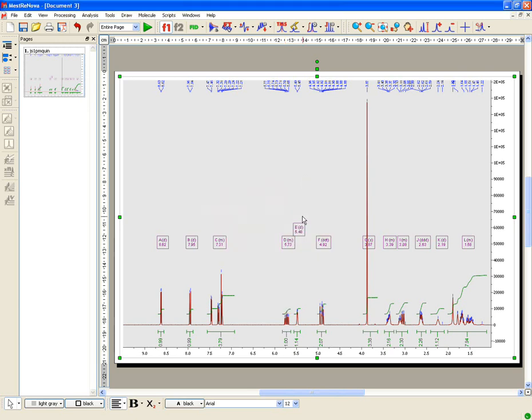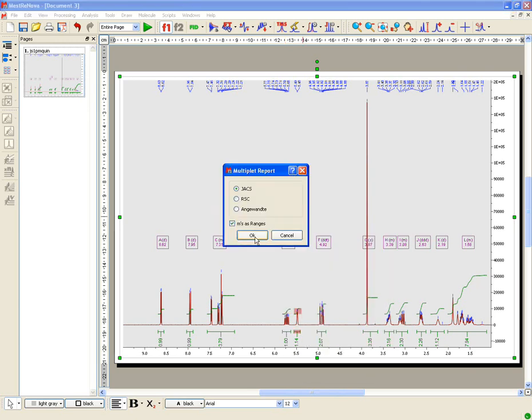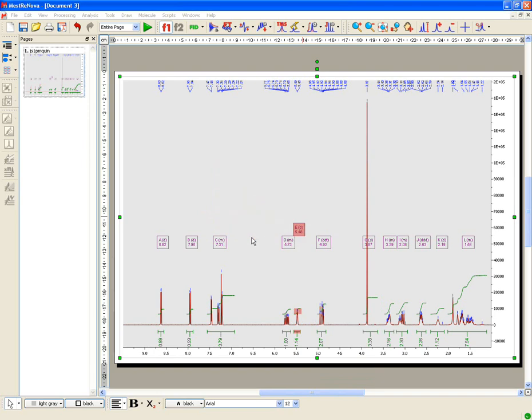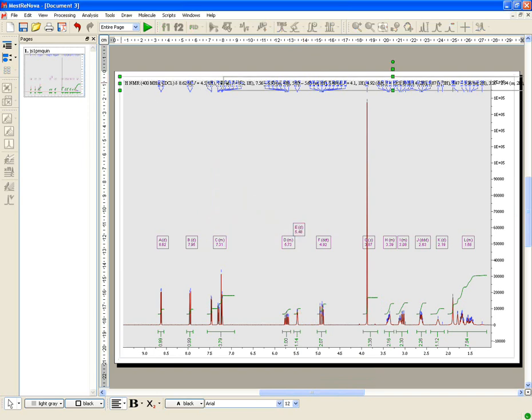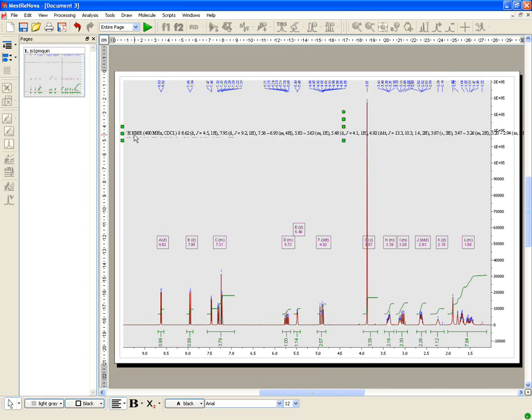Right click on the multiplet box and select Report Multiplets. This will display the Multiplet Report dialog box, which will allow the user to select the desired template: JACS, Royal Society of Chemistry, and Angewandte.